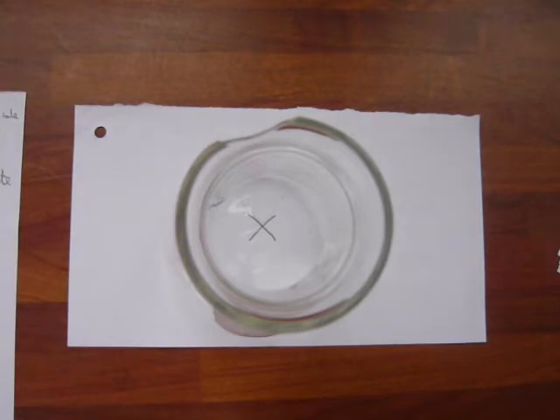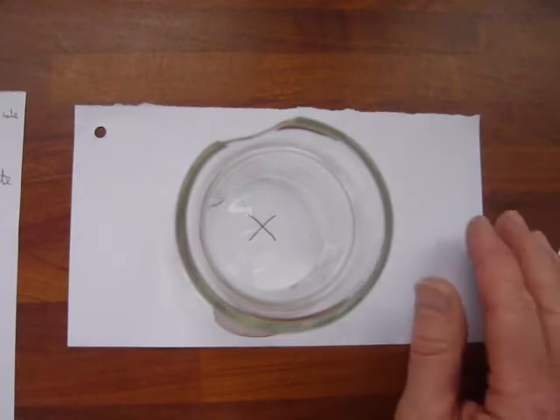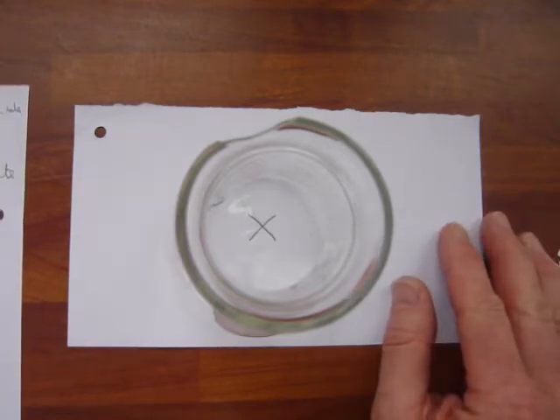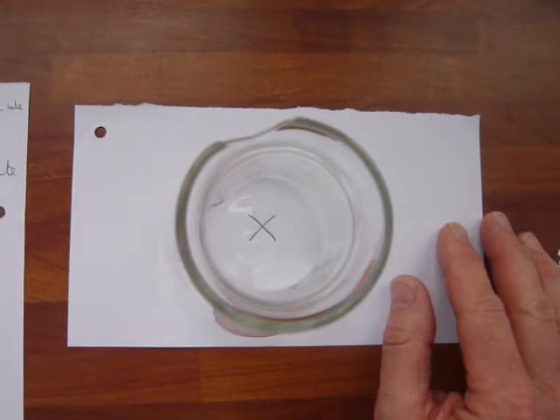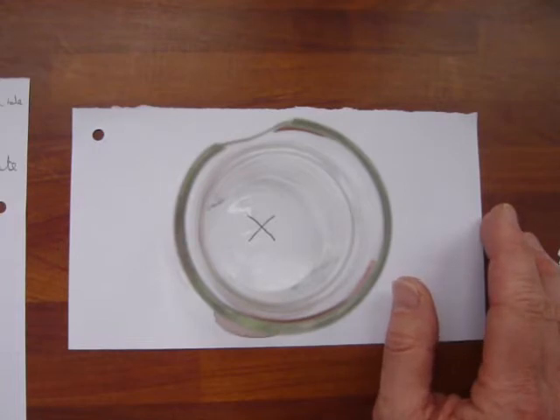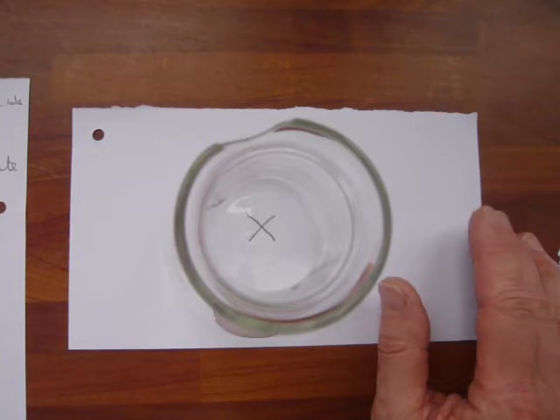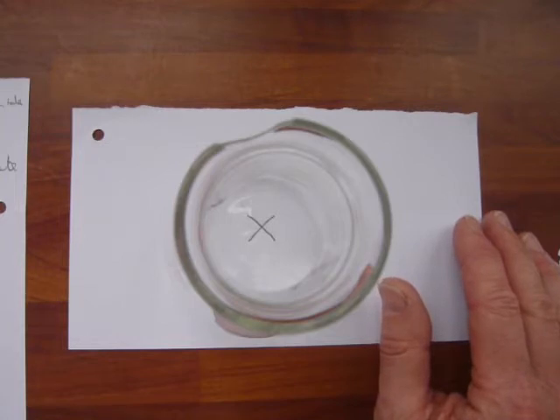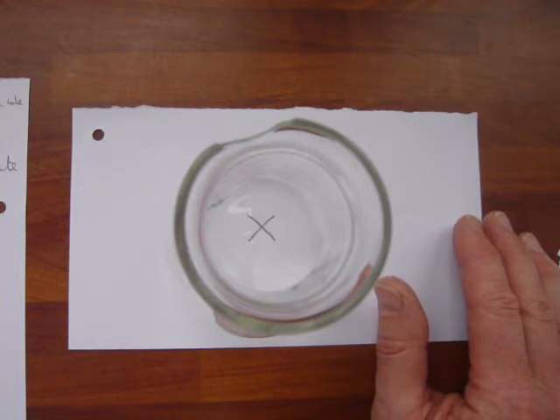This experiment has lots of what we call control variables. The control variables are the variables you have to keep the same to make it a fair test. Obvious things to keep the same: you have to keep the volume and the concentration of the acid the same, and the volume and the concentration of sodium thiosulfate the same. You're changing temperature. The two things that are most likely to affect the reaction are the concentration of the two chemicals.